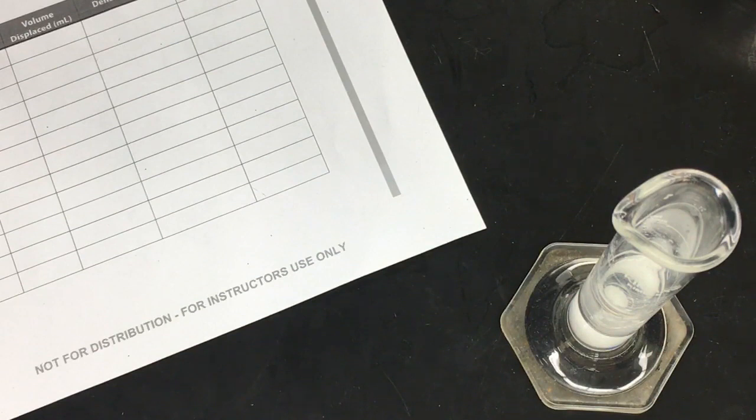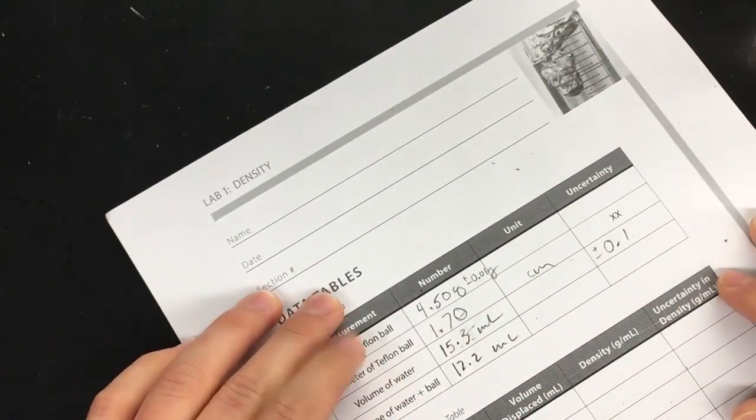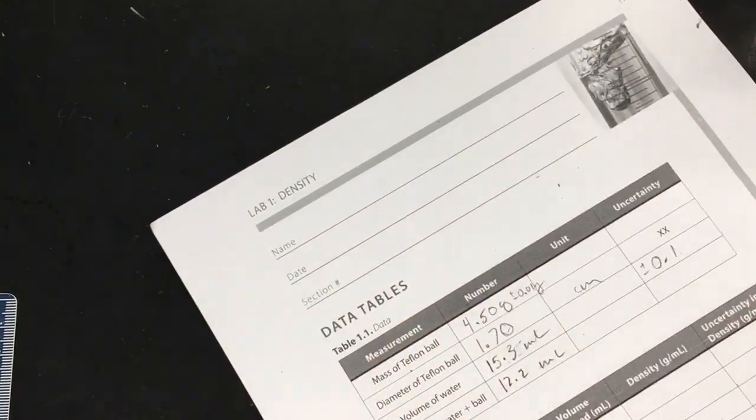1, 2, so that is 16, 17. Looks like it is now 17. I'm going to say 17.2. It looks like it's at 17.2 milliliters. Okay. And so what we care about here is the delta of the water.